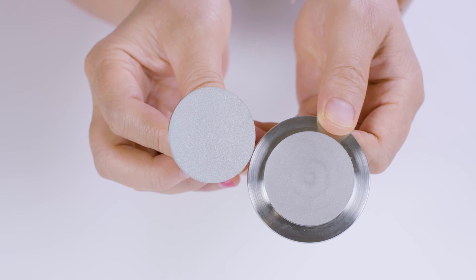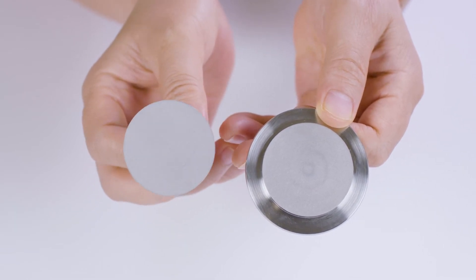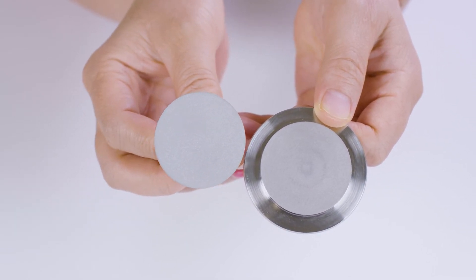This sandblasted plate is good for testing soft gel-like samples such as hand lotion, shampoo, or mayonnaise.